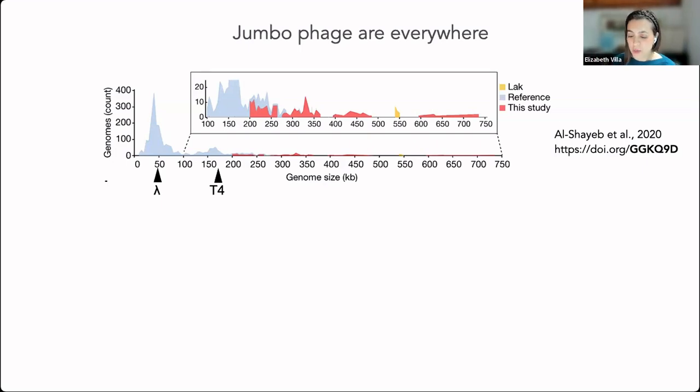And when we started working on this, people were wondering, well, are these exotic, random, did you just find a very exotic organism? And don't get me wrong, I really like exotica, but this was more related to these phages were not found simply because the filters that people used to look for jumbo phage were just too small, 100 to 150 nanometer filters. Here we're talking about phages that are 200 nanometers or so, simply weren't discovered because they just were not included in how we acquired the sample.